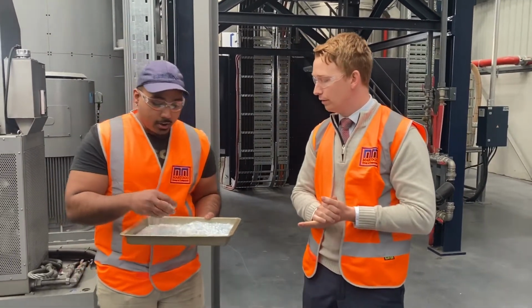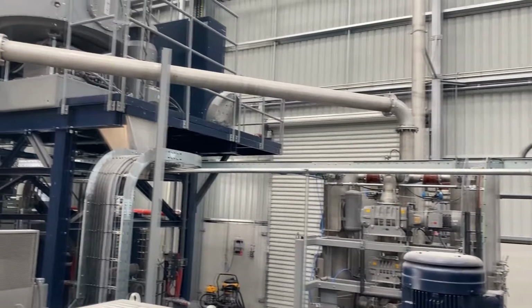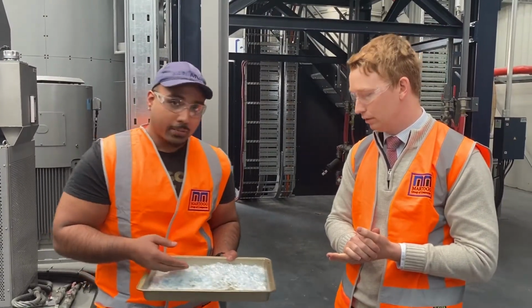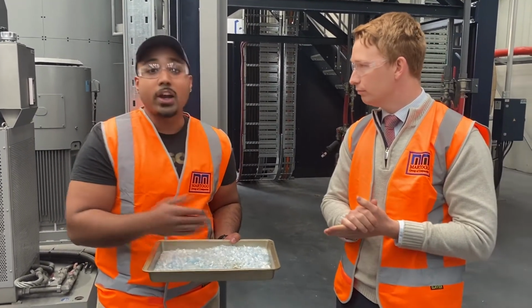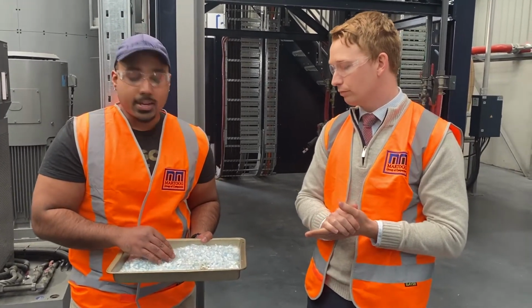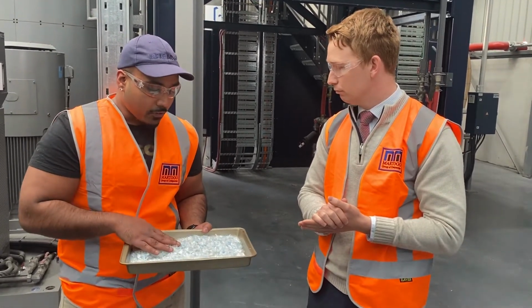Yeah, thanks man. So for what we do, obviously we have the technology over here to make food grade recycled PET, but a key thing that we need to understand is that we are only as good as the raw materials that we put in. So a key thing that we do with raw materials that come in, we do raw material tests, a variety of tests to make sure that they meet the quality protocol standards. But the main test that we do is an oven test. So we put these flakes, regrind in the oven.